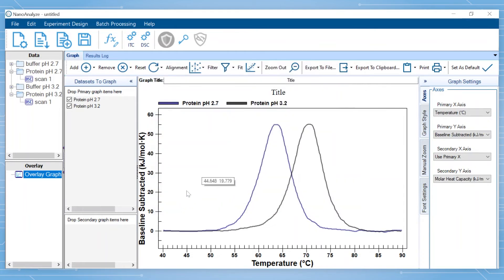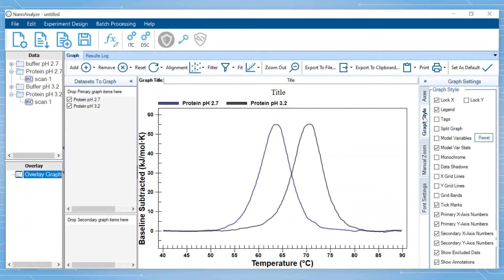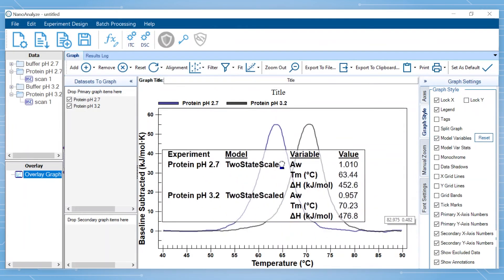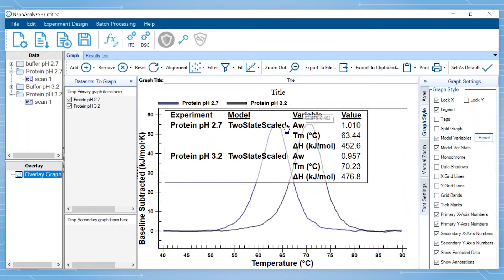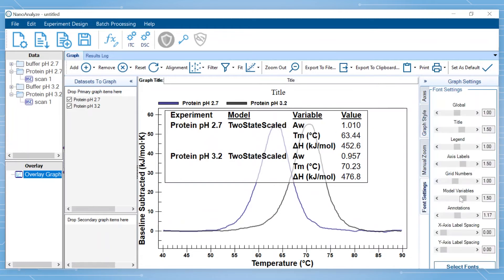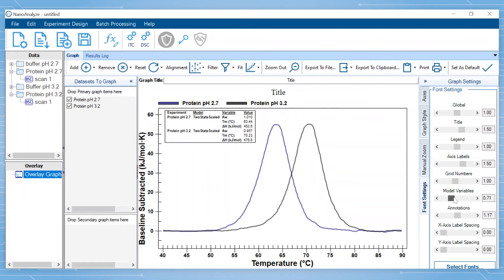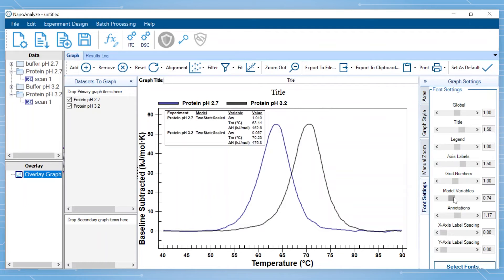To show the modeling information, select Graph Style and then check Model Variables. To resize, click Font Settings and use the slider bar to adjust accordingly. You can also modify other font sizes on this tab to your preference.